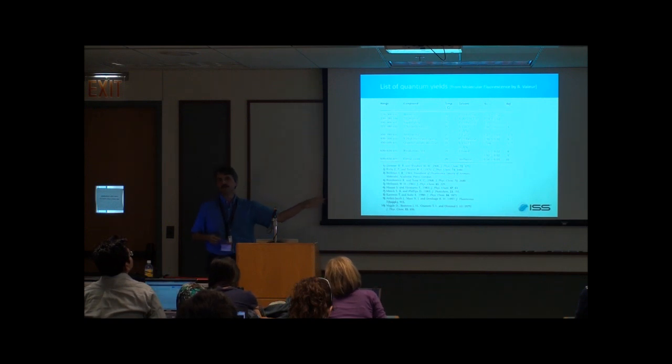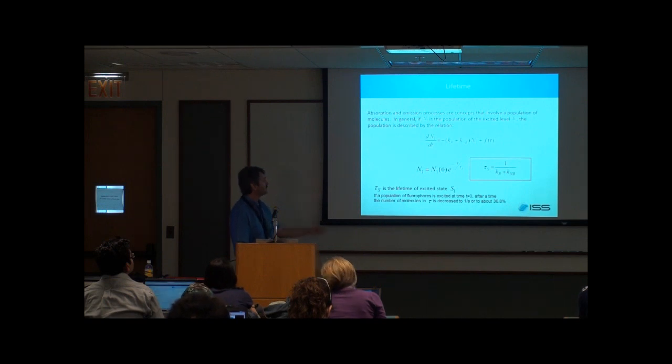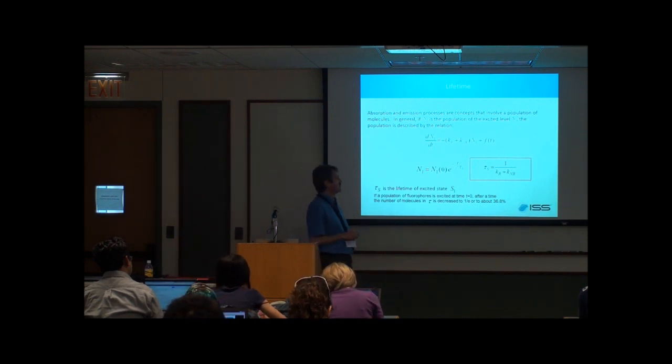Of course, there are also other considerations, such as how this molecule attaches to other molecules. But the first parameter to look at is really the quantum yield of the molecule. Now, another very important parameter is the decay time, or lifetime. So how do we introduce this concept?